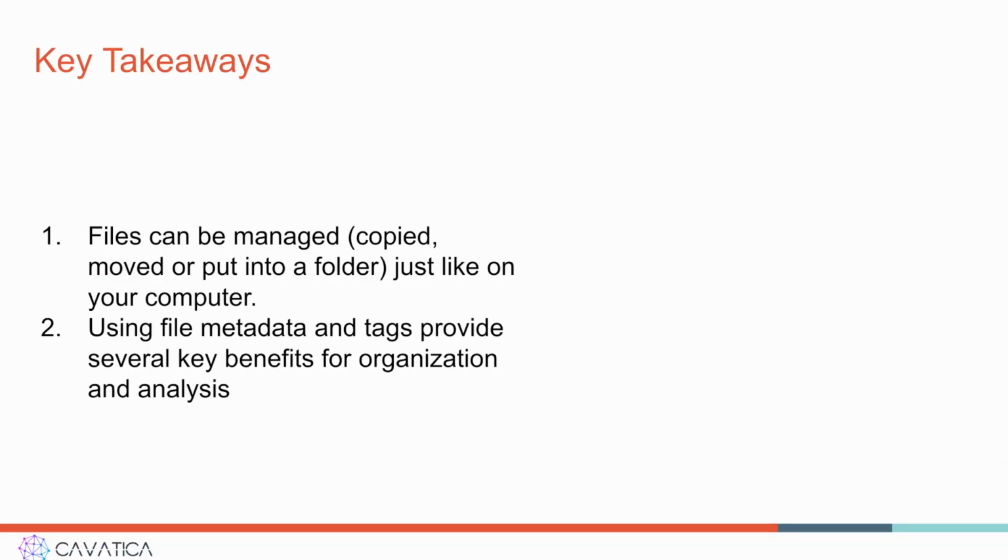The key takeaways here are that files can be managed, they can be copied, moved, put into folders, just like on your computer. This changes the symbolic link, but not where the data is actually stored. This prevents the data from being moved around and generating costs for transferring that data.